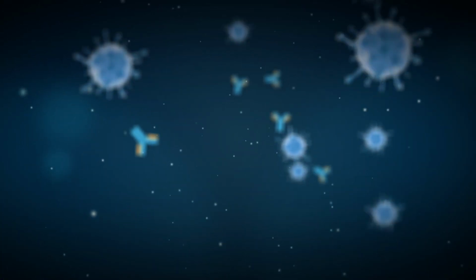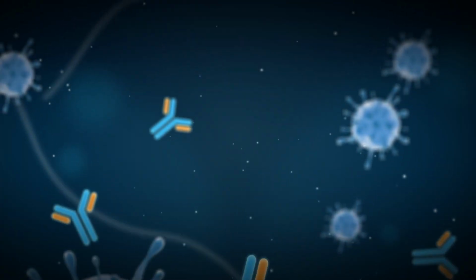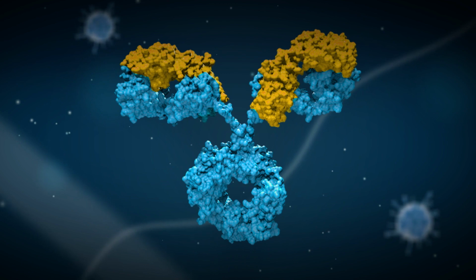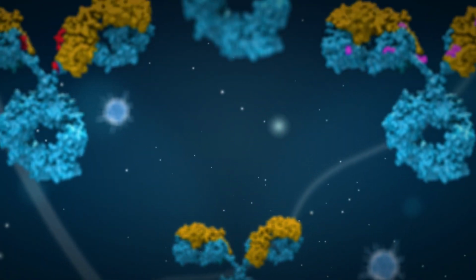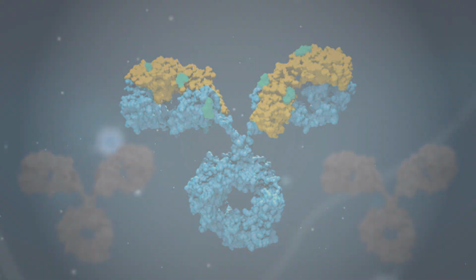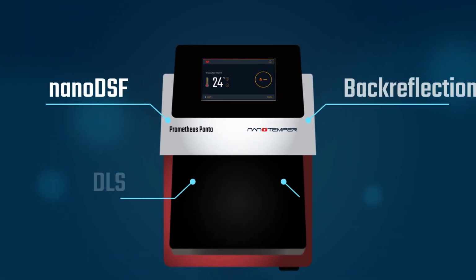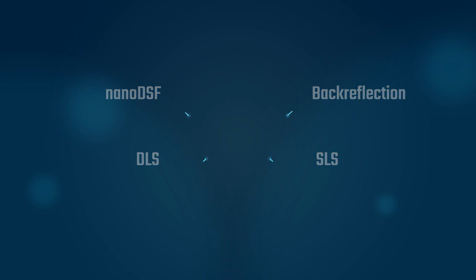The decisions you make about your biologics candidates early in the pipeline ultimately affect their success as therapeutics. The combination of sizing and stability information offers valuable insight into the viability of your protein-based biologic candidates, enabling you to select the best ones for further development. The technologies inside the Prometheus Panta provide high-quality sizing and stability information about your candidates that enables better pipeline decisions.